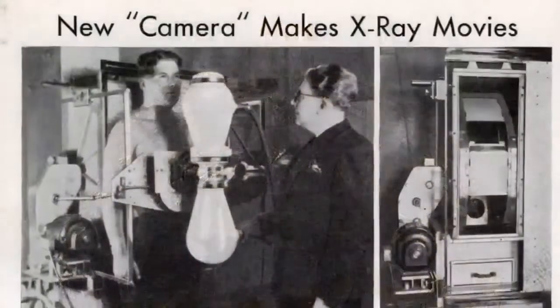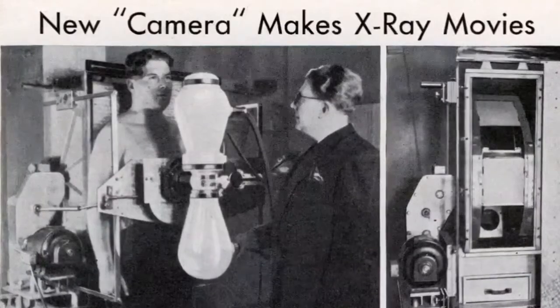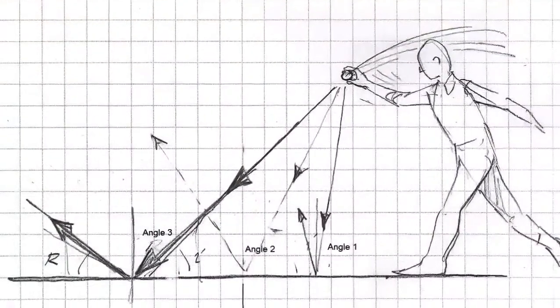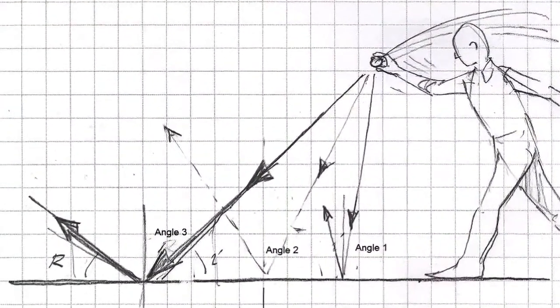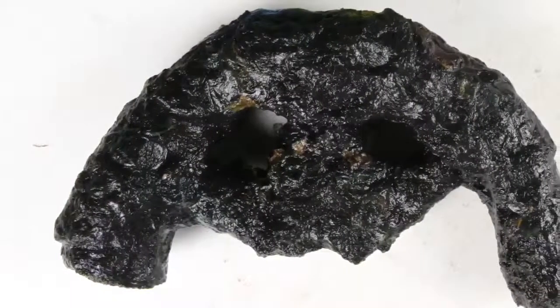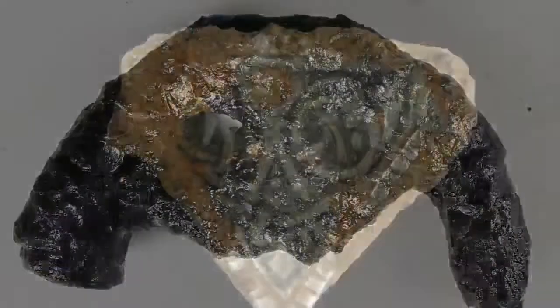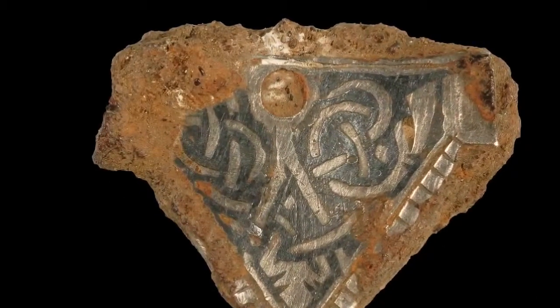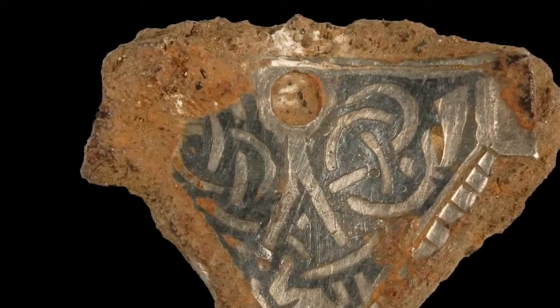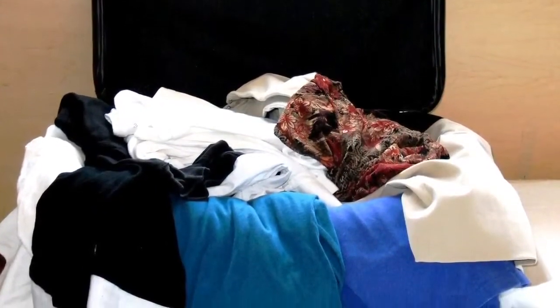However, before we all get carried away, it should be pointed out that EDXF does have limitations. For example, it can only analyse the very surface of an object. With rusty objects, this can have serious ramifications. We only really learn what the concretion is made of. This can mean that details of an object are invisible to EDXF. It's also worth pointing out that the test chamber is very small, so you're limited by which objects you can actually fit into the machine.